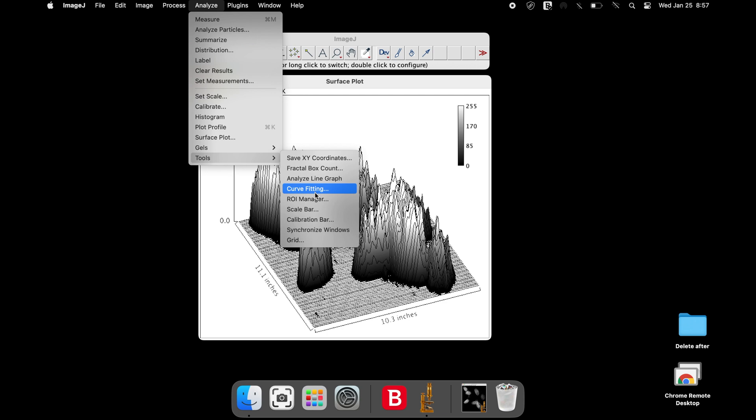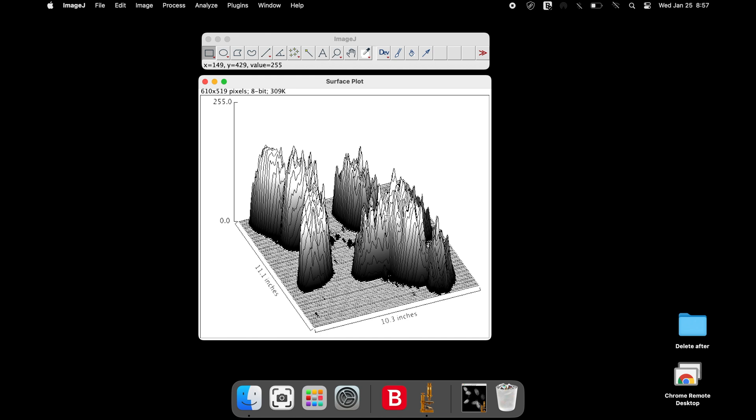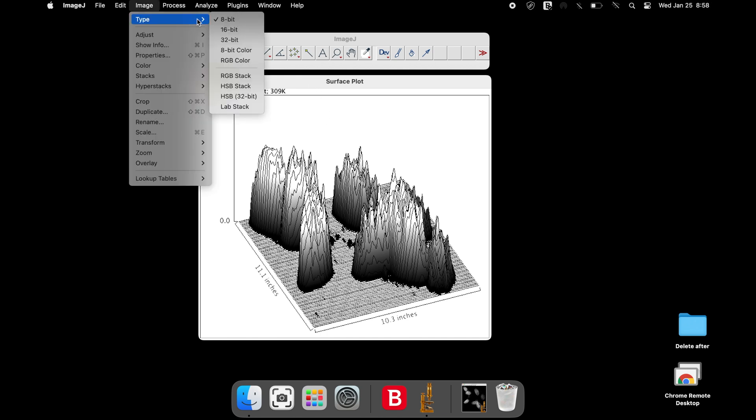First, remove the calibration bar of the surface plot from the image. Once removed, change the image type from 8-bit to RGB color.